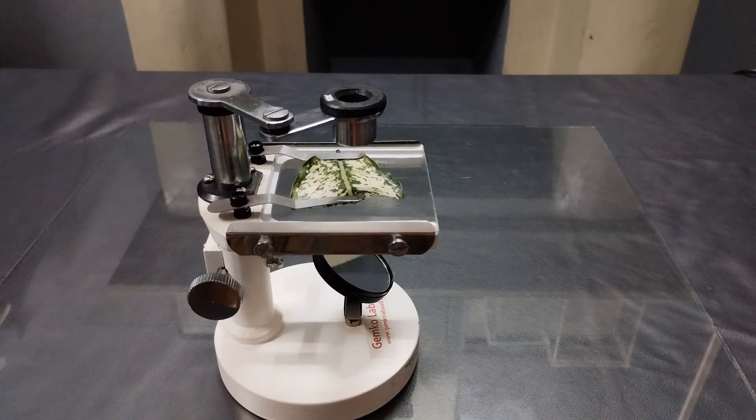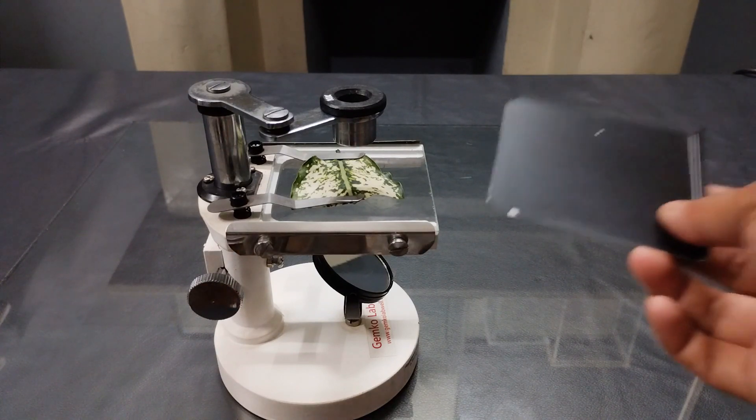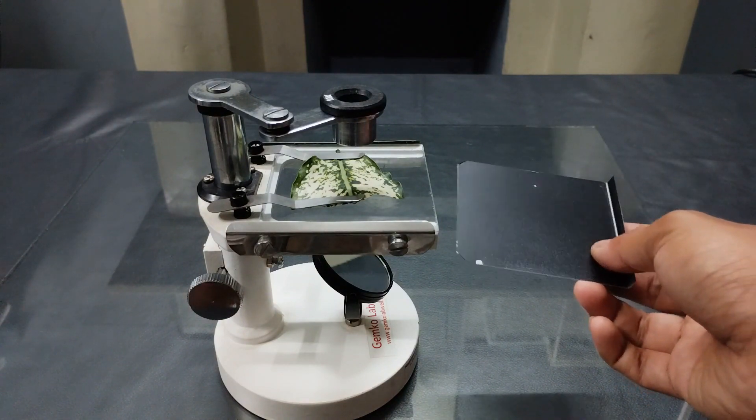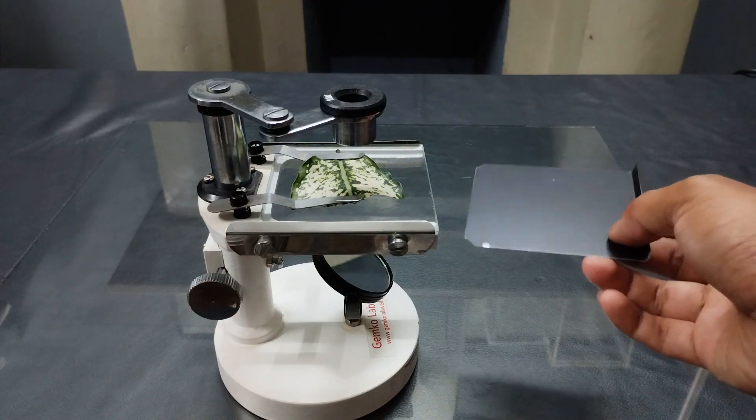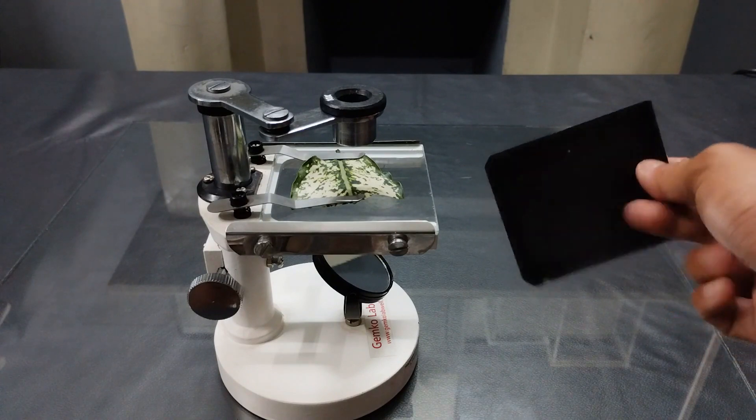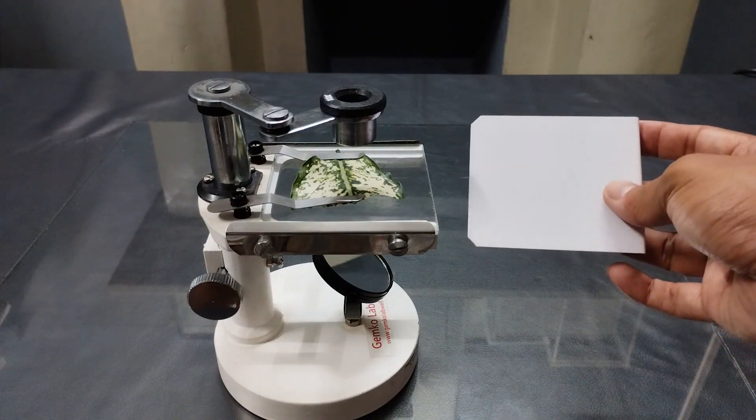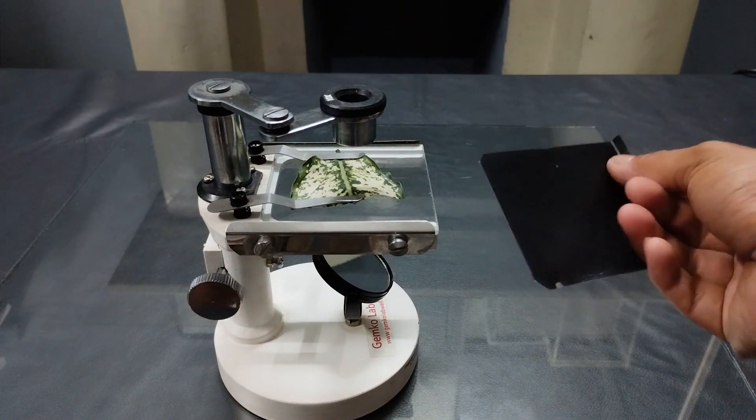If the specimen is of an opaque nature and you need to do a surface examination using reflected or scattered light, then all you need to do is insert the accessory stage plate beneath the glass stage. Either the black or the white side of the plate can be used depending on what color background you need during the examination.